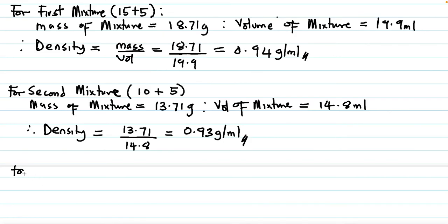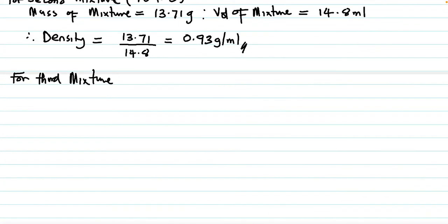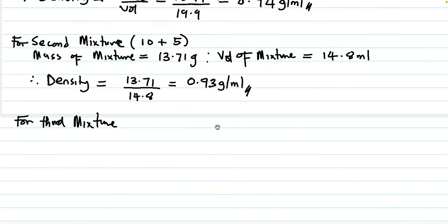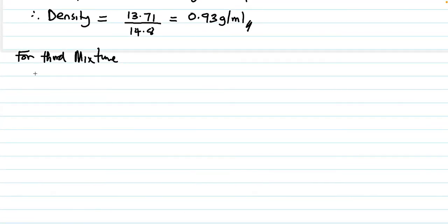All right, let's proceed to the third mixture. Let's get it straight. The third mixture is actually 10 plus 10 mil.